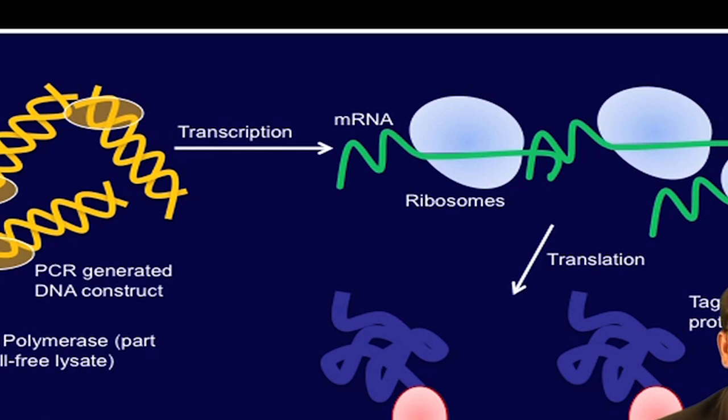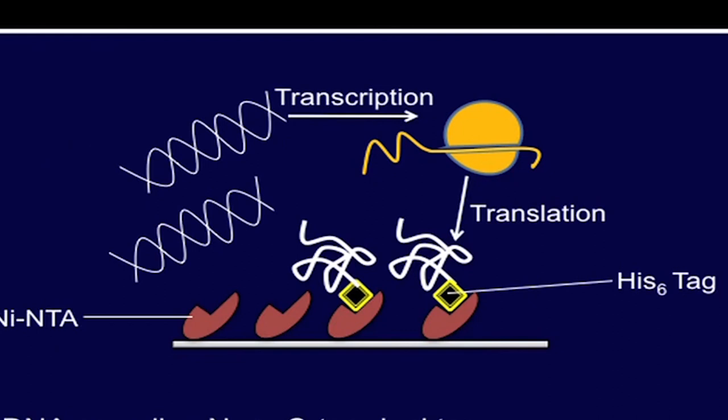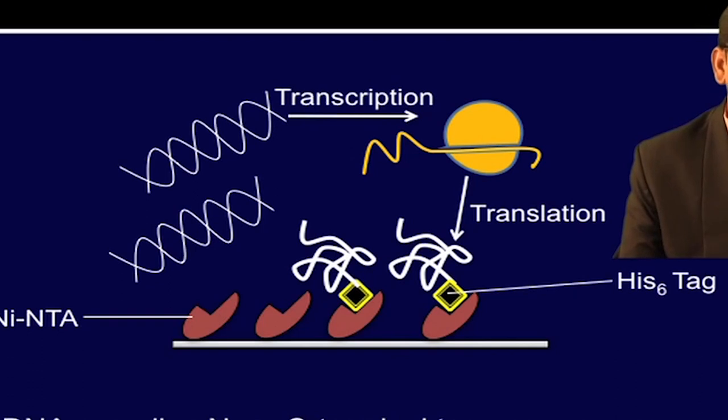As shown in this slide, by using the cell-free expression system, DNA is able to produce protein through transcription and translation processes containing histidine tags which get adhered to the nickel NTA surface. Overall, the PISA method utilizes PCR DNA which encodes N or C terminal tag sequence and then transcribes and translates the cDNA of interest into the protein. This protein, which is synthesized after the cell-free expression, gets specifically captured by the tag capturing agent. Scientists He and Taussig have developed this method successfully and carried out the expression and functional immobilization of a fragment of human anti-progesterone antibody in microtiter wells and used luciferase enzyme on nickel NTA coated magnetic beads.